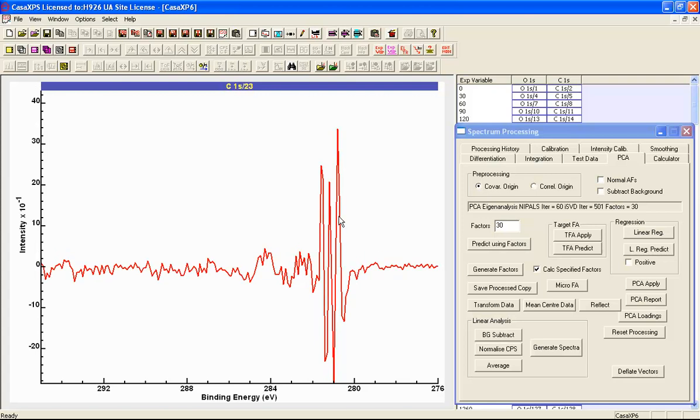We see greater variation here because this is where the polystyrene peak is intense, and by virtue of Poisson statistics we would expect the noise to vary as the square root of the counts per bin, hence we see this shape here. But for the most part this is looking very much like the noise we would expect from an XPS spectrum.